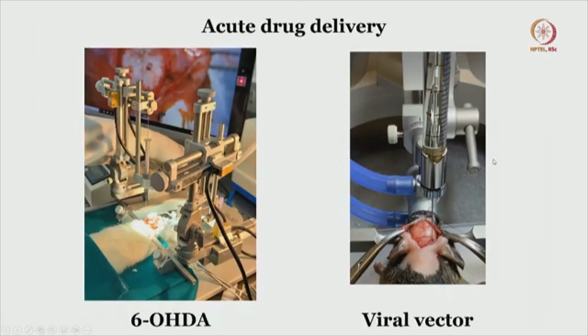Alright. So, let us see how the different techniques or the usage of these stereotactic surgeries in various experimental methodologies.